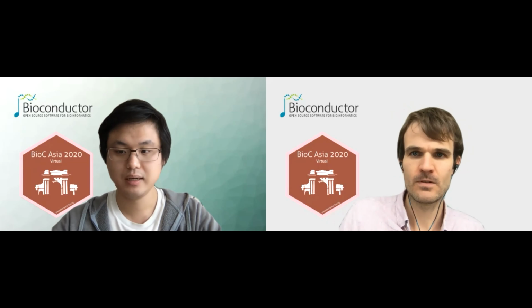Lei asks, how about PacBio DNA methylation data? At the moment, I don't have any support for that, but given that the format that I use for my plot is agnostic to what technology it came from, as long as you have a table that tells you what positions are methylated and which are not, potentially you can use the package for PacBio data as well, but currently it's not something that I've looked at.